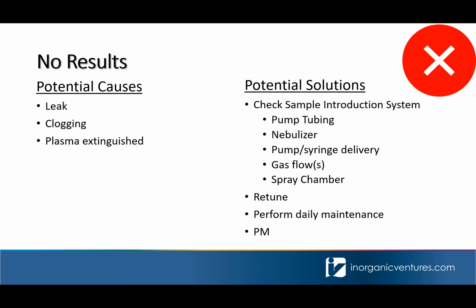Also, your nebulizer. Concentric nebulizers are commonly used, but they suffer from clogging more than other designs. Recently, there have been some improvements in the ability of a concentric nebulizer to handle high total dissolved solids load, but in general, other nebulizer types may be better for your analysis if you're running high TDS samples, or your analysis contains high TDS components. Another nebulizer like a crossflow may be more appropriate for those situations.